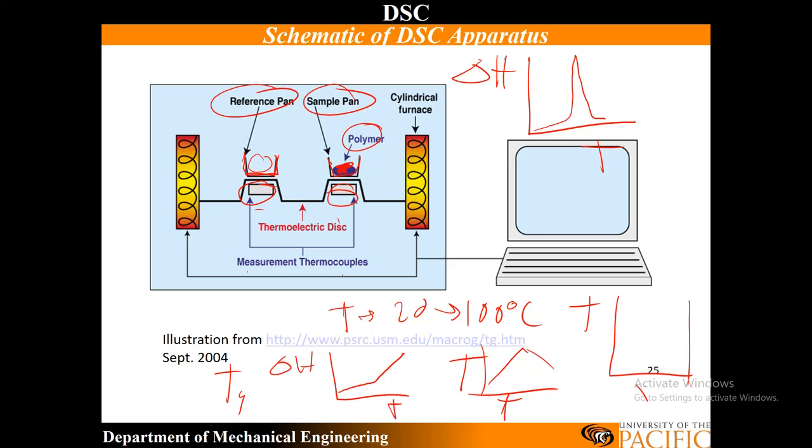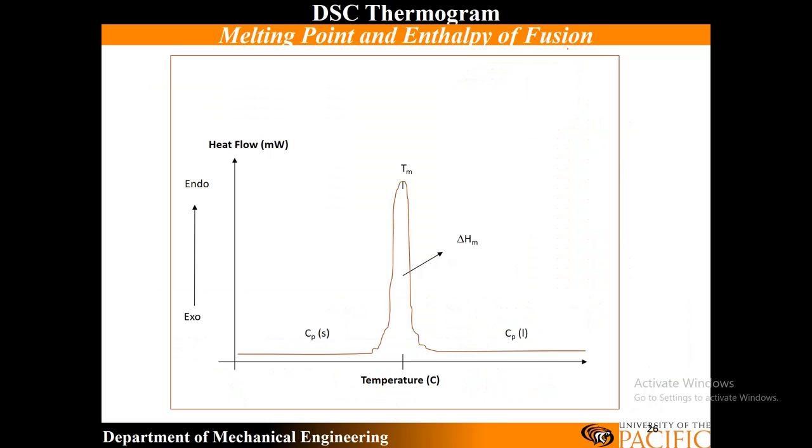It's a composition of stearic, for example. We're going to measure and see where the liquidus lines and the solidus lines are, and where we have multiple peaks, and that's what the DSC is going to allow us to do. As you mentioned before, if I take the integral of this curve, that gives me my enthalpy of fusion. This temperature right here is my melting temperature. Again, I can calculate the slope to give me the specific heat capacity, but we're not going to do this in this particular lab. Again, something for another day.